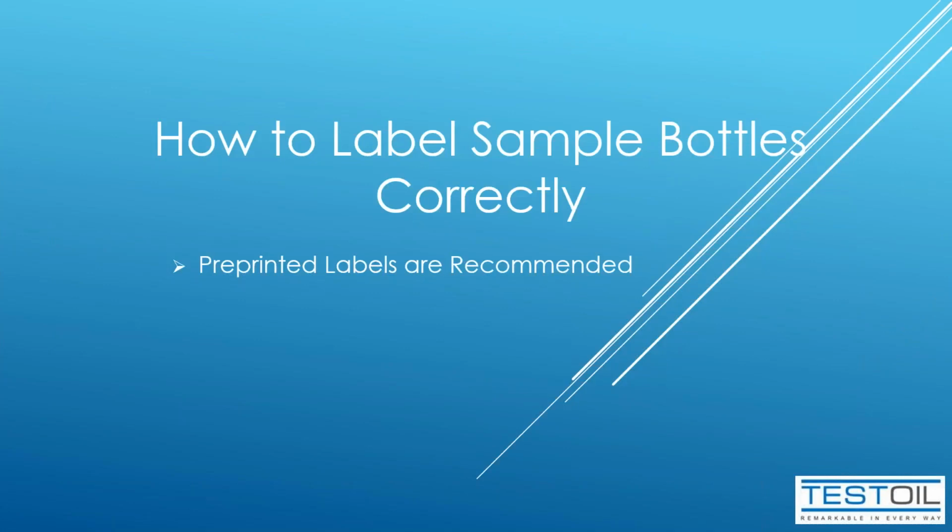Okay, next I'd like to talk about correctly labeling your samples to ensure immediate processing once they're received. Of course, pre-printed labels would be our first recommended choice.